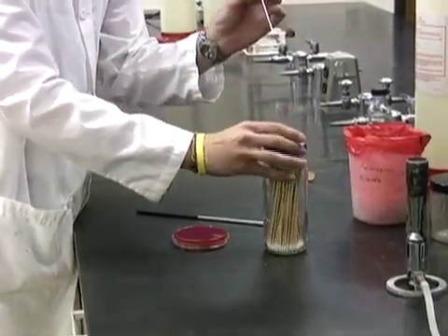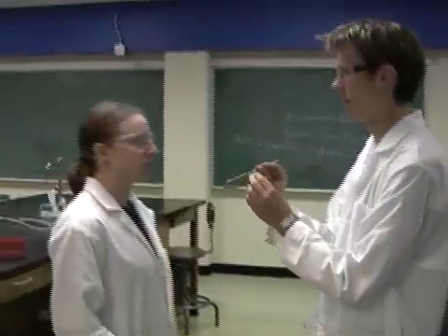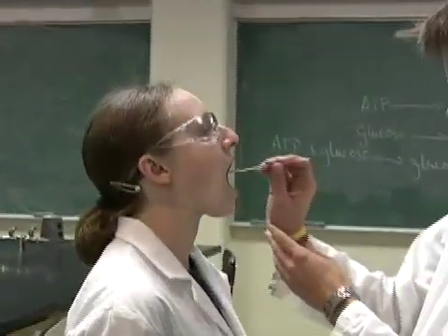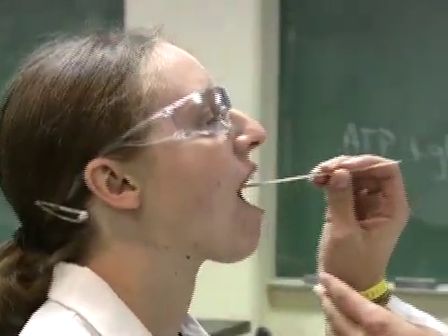Using a sterile swab, you are going to swab the back of your partner's throat. Be careful not to touch the uvula with the swab, as this will elicit a gag response from your partner.